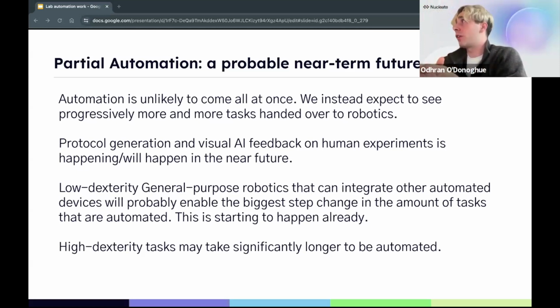Ultimately, it's likely that a lot of high dexterity tasks are still going to take a long time to automate because the underlying hardware for high level precision isn't really there yet for current robotics. And no doubt the first wave of mass manufactured robotics for robotic automation isn't going to have this fine level of dexterity as a primary consideration, because for most manual tasks, you don't need that. So that gives a summary of the sort of model of the possible future for lab automation. That's my when might it happen part of the talk.